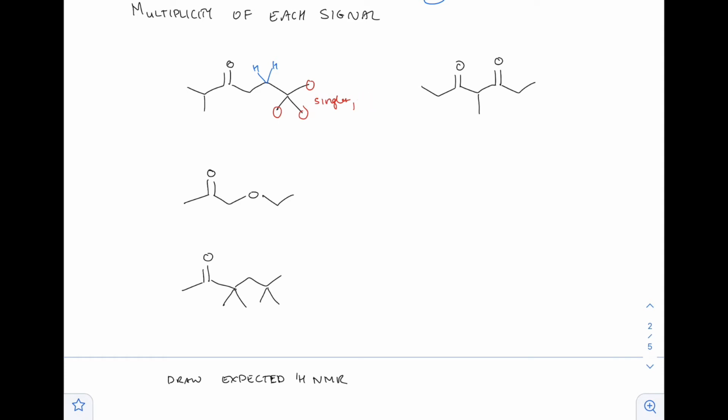Anytime you see a singlet that's 9 hydrogens, you want to think of this chicken foot right here. Bada bing, bada boom. Chicken foot is in the room. So these 2 protons right here are next to these protons right here. We don't have any diastereotopic protons here. So basically, those 2 protons are coupling with the blue protons.